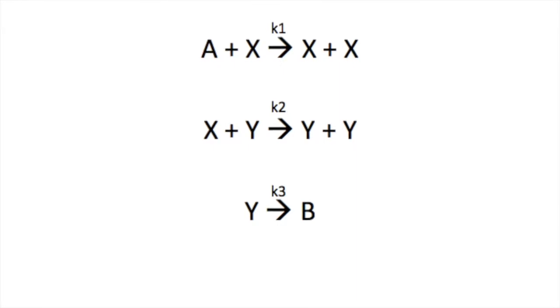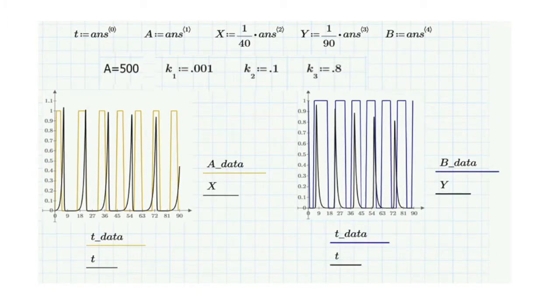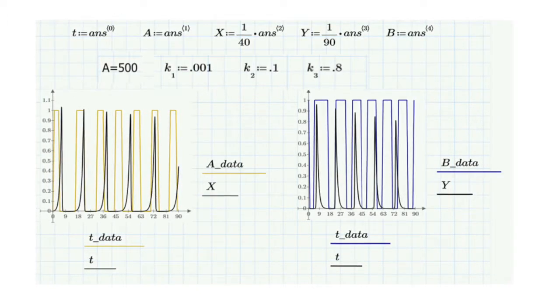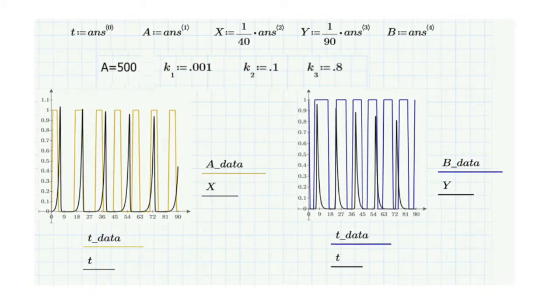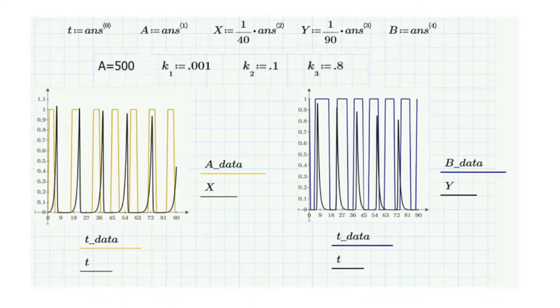The third reaction in the mechanism describes the end of the oscillations, which was not observed in the length of time we ran the reaction. Here, the digitized data is shown. The graph on the left shows the reaction data for the iodine solution, and the graph on the right shows the data for the blue starch solution. The boxier plot is representative of the experimental data, while the curved plots show the numerical simulation of the reaction.